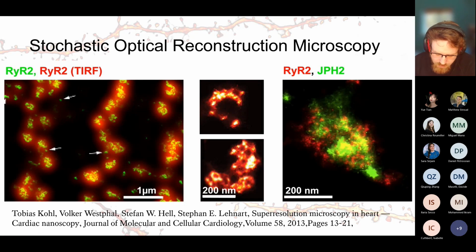And for sub-organelle morphology, that sort of thing, you can really start to look at. And I'll mention again that there's a lot more involved with the sample preparation, which, as I said, we have experience and all the information to give to you if you're interested. But it's just a preface to the idea that STORM imaging is very possible, but you do need to do it correctly.